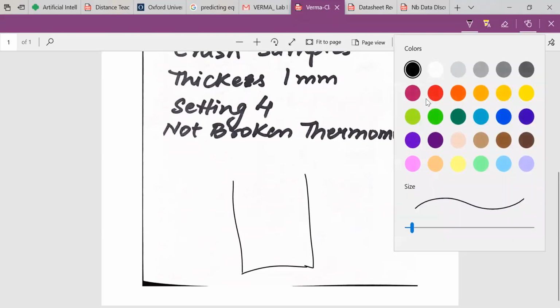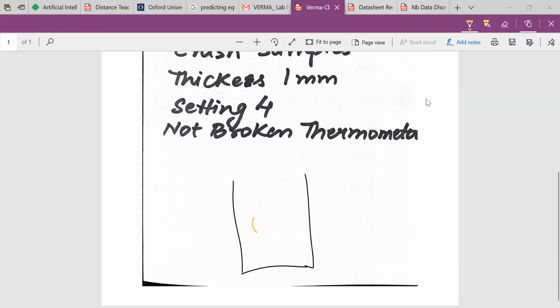We see that the bubbles rise to the surface, and then at the surface they splatter, and they may rise unevenly at different locations and then splatter unevenly.